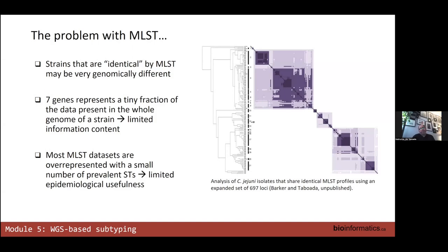But I also told you that I wasn't a big fan of MLST. And so now I'm going to destroy MLST over the next several slides. The first one was that even back in the day, we already knew that just because you said this is ST21 and that's also ST21, they weren't necessarily very similar at the genome level.